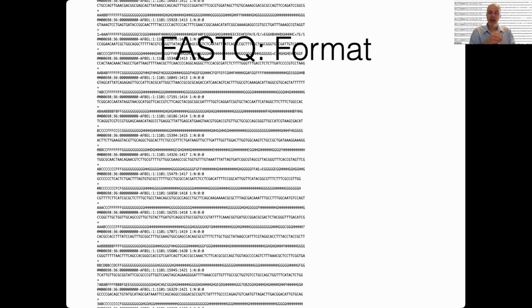You're guaranteed, because both the measurement is error prone and the polymerase that's actually adding the base is error prone, that even if the correct base is T, you're going to get some misincorporation within that cluster, because it's millions of molecules of other bases. Even though we look with our eyes and see, okay, that's really red, as I showed you in the figure last week, you're going to get some other colors from that spot. And so that's also almost certainly going to contribute to the information.